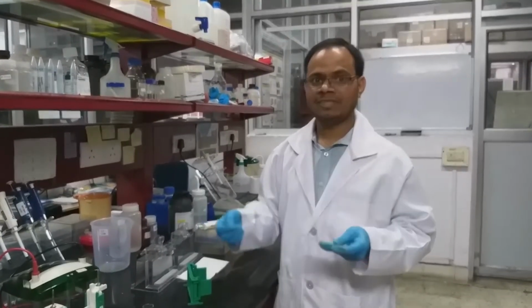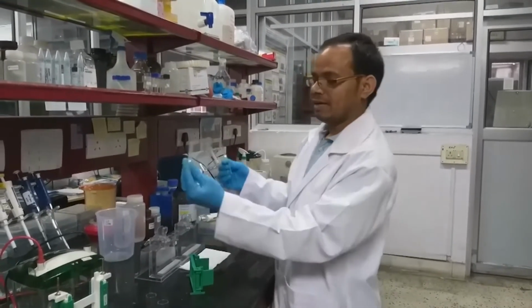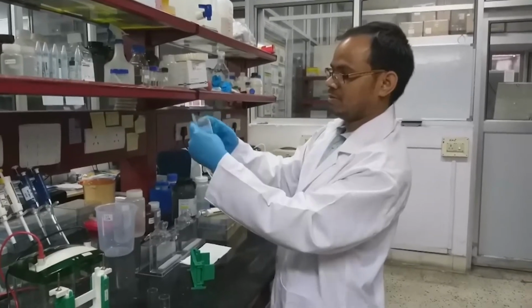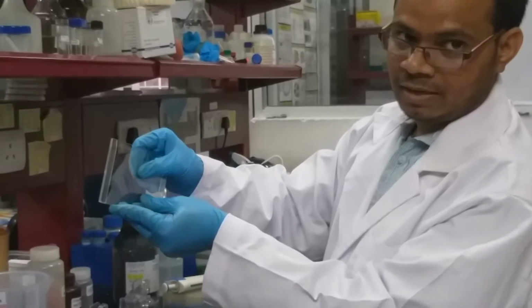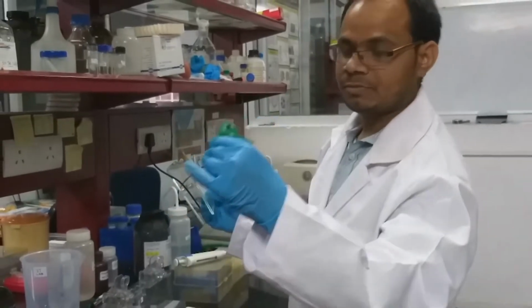But if you have larger volumes, like 70 microliters, you can use a 1.5 mm gel. You have to arrange the short plate on this plate like this, and the bottoms should be equal. Then we have to put it in this tray.